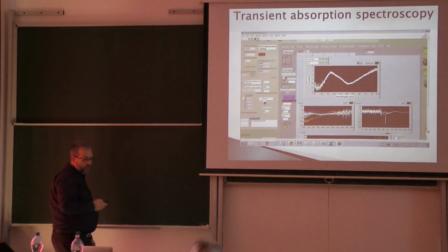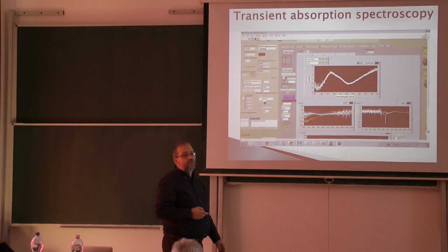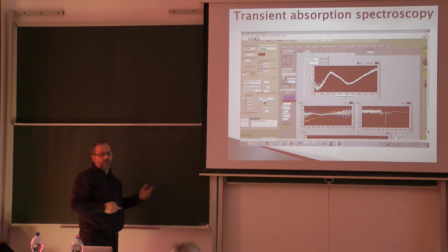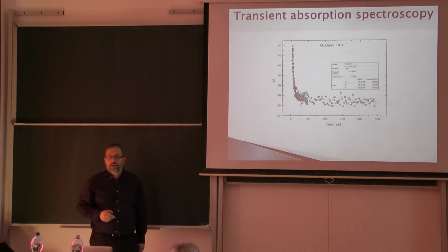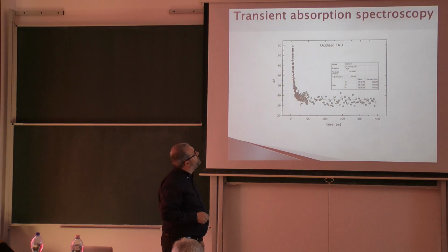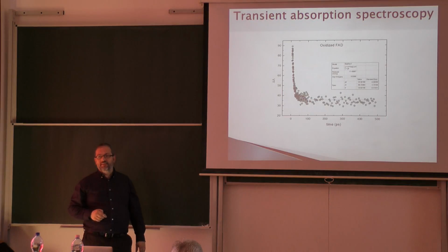Now, as I talked to you a lot about the flavins, of course we tried out the system for FAD, which has a short fluorescence lifetime. And we can see that the oxidized flavin relaxes back quite fast indeed. We have a 10 picosecond relaxation here at 500-ish wavelengths. This is what we measured just recently. This is basically a test measurement.